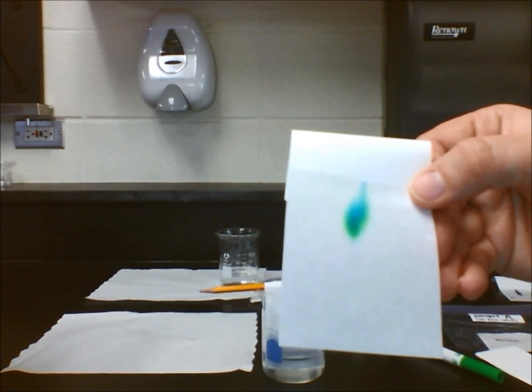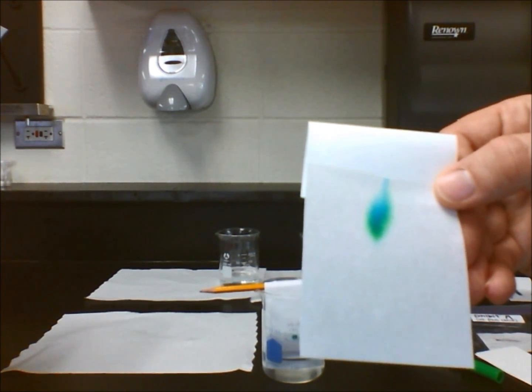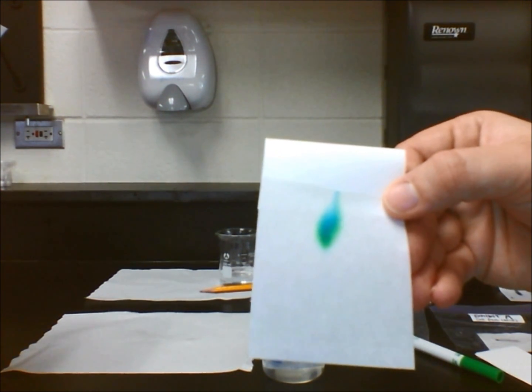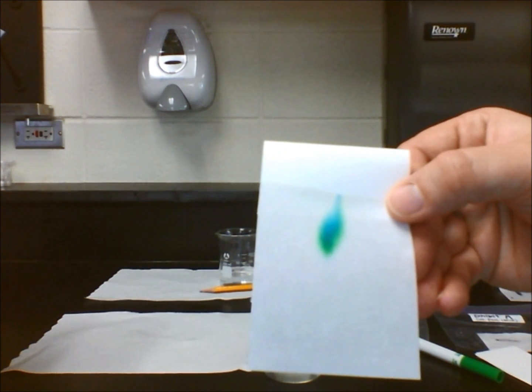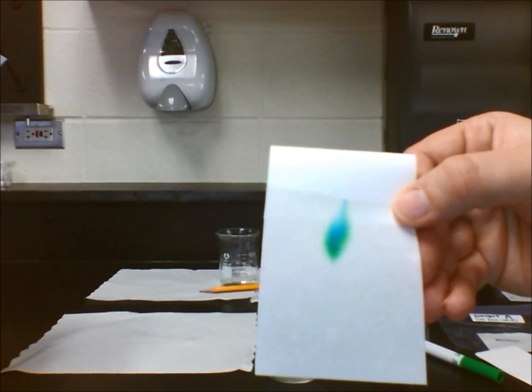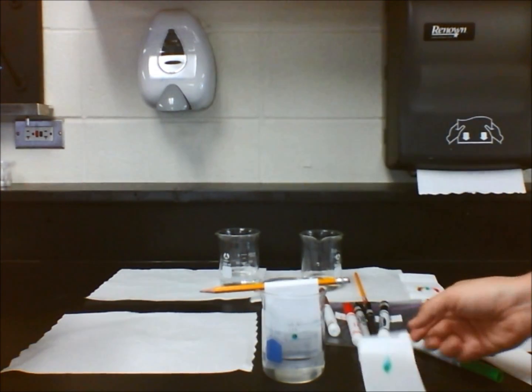Also, the blue and yellow solutes have different solubility rates because they are traveling up the medium at different speeds. The blue solute is more soluble than the yellow solute because it is higher up on the paper.